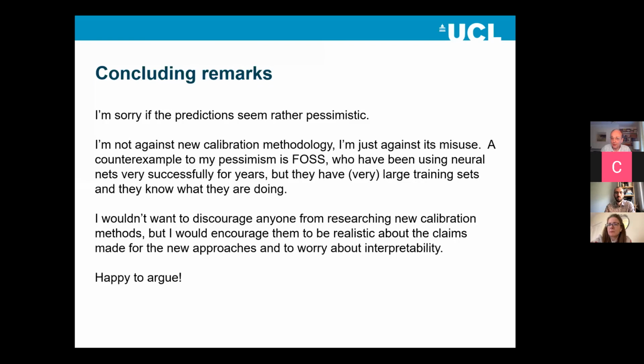There are some ways around that. If you can get hold of a lot of samples but you can't afford to analyze them, then you can measure the spectra of all of those samples and then use various algorithms, Kennard-Stone's the most common one, to choose samples that span the space of spectral variability. And then just do the reference analysis on those. So if the limitation is you can't afford the reference chemistry, you can sort of cope with that a bit.